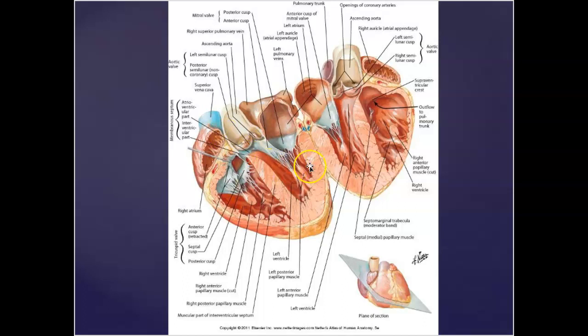So you can see here on this shot too, nice dissection of the myocardium. You'll be able to see this in your dissection today as well. That myocardium on the right side is much thinner. And you'll see it here on the left side much thicker, right? So it has to pump through the systemic circulation on the left side versus just the pulmonary circulation on the right. So the differences there are depicted with the size of that musculature. So again, pumping out then the aortic semilunar valve into the aorta as it comes towards the rest of the body.